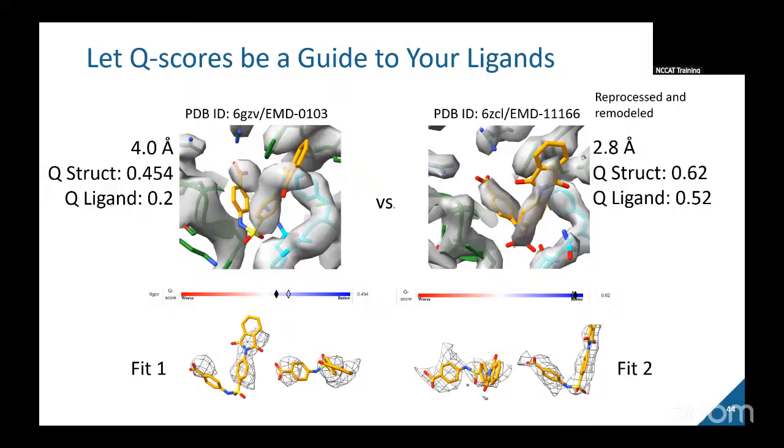So just in terms of a trajectory of the improvement of certain models as the maps improve in the archive, I guess the intention is not to flag models like this because they did the best they could. Yeah, it's a good point. Again, as I was saying earlier, it's really important to be as accurate as we can with the experimental data we have, because data's messy, and sometimes it's okay when there are limitations, and they can see it when they look at the map and then they see it in the reports. Say, blue line on the left. I mean, you don't have a new map to kind of.